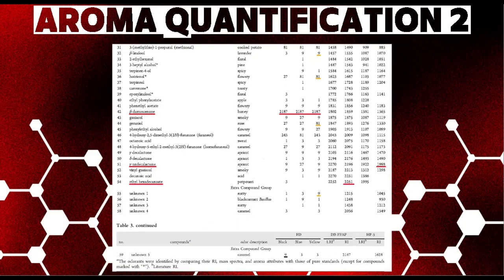In the FD columns, data that were underlined indicated the possible effect from different press fractions. Yellow lines highlight the highest press fraction from the yellow labeled sample, and the same goes for the black labeled sample with the lowest press fraction, underlined by a black line. One point of interest in this table is that the compound beta-damascenone not only showed the same FD values, but also the highest from all three labeled samples.